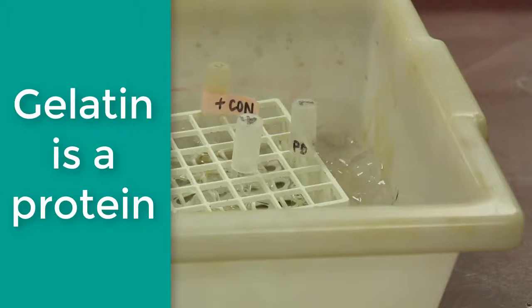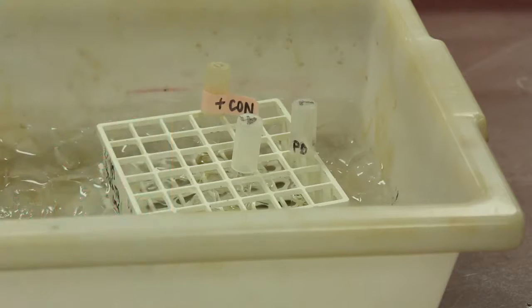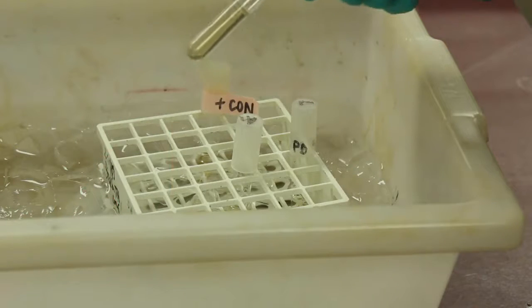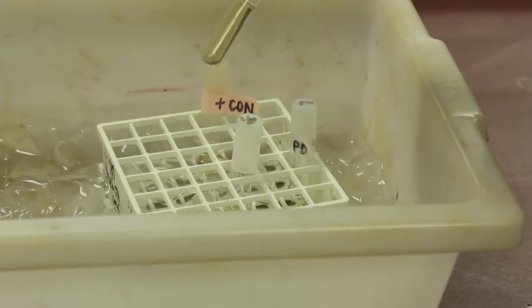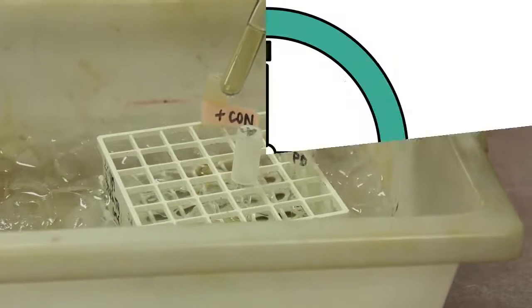But it's actually a protein, even though we use it as a thickener. The gelatin test is a solid test. You inoculate it as you would a SIEM test.